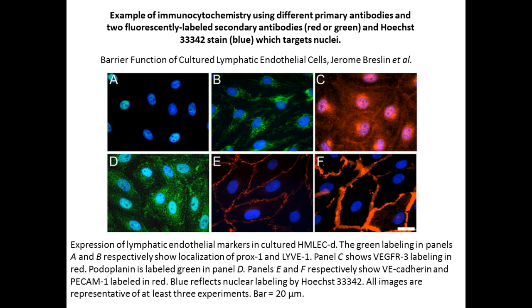So they're using primarily two here. They're using a red and a green. And then they're using a dye to stain the nucleus of the cells. And so they were able to stain specific molecules. And what this is helping is notice that, what do you notice about this? Look at the red, right? And then look at the green. What can you tell me? You can tell me location, right?